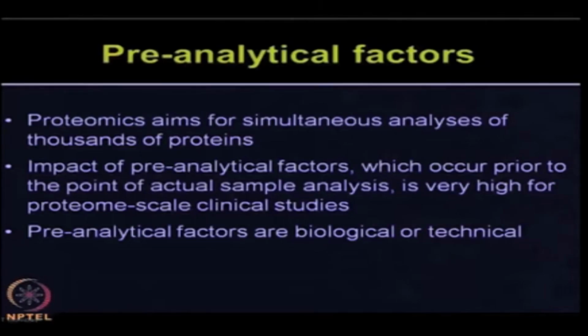So, most proteomics applications aim for simultaneous analysis of thousands of proteins of a given clinical sample, whether it is serum, saliva, urine, CSF or tissue. The impact of pre-analytical factors which occur prior to the point of actual sample analysis is very high for proteome-scale clinical studies.